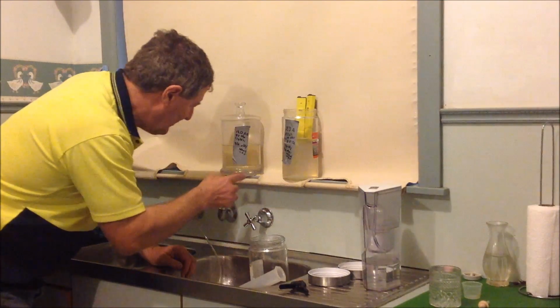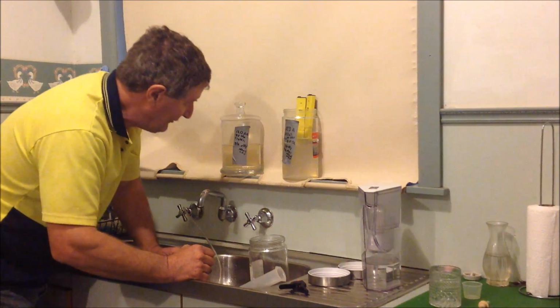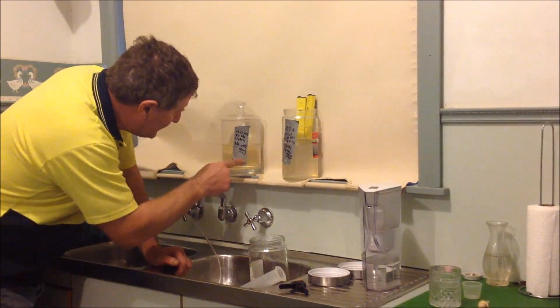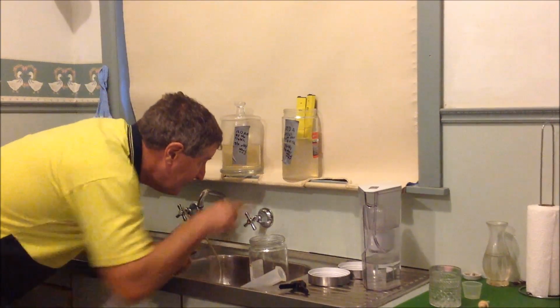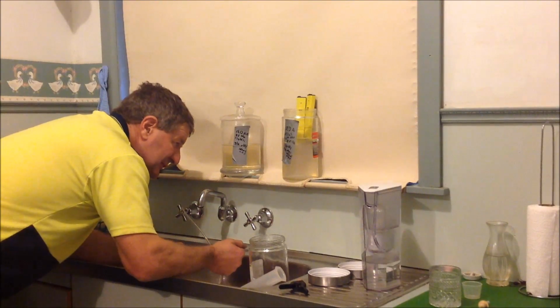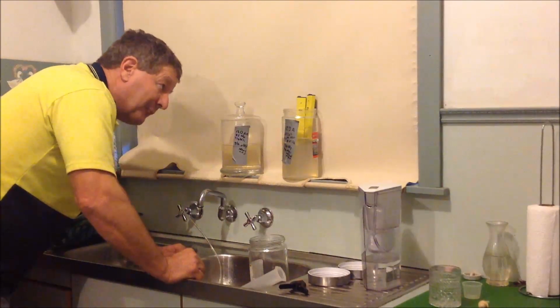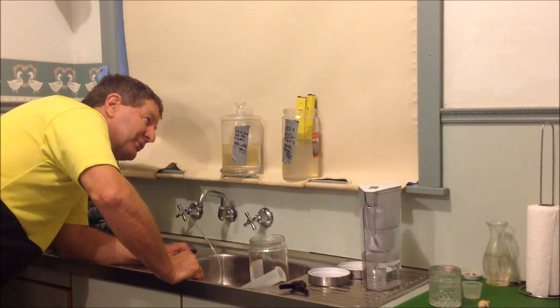Well, you can see that they're both cleared. It's the next day, so it's been about 24 hours. This one I've had to put about 3.5 extra mil in to maintain the pH. This one only half a mil, and they have got a very fine precipitate in the bottom, brownish. Could be dust that's gotten into the sample because it's been several weeks and the top's been on and off, and yeah, it could be something like that.